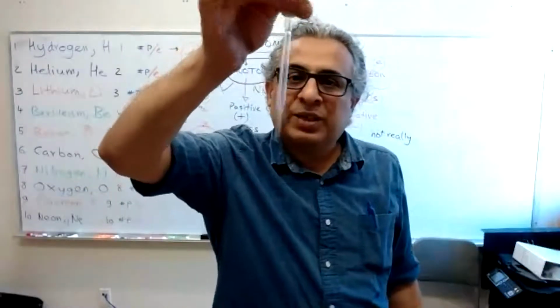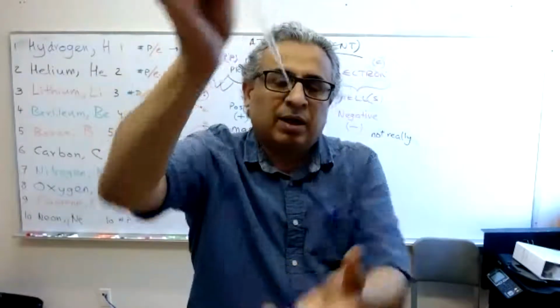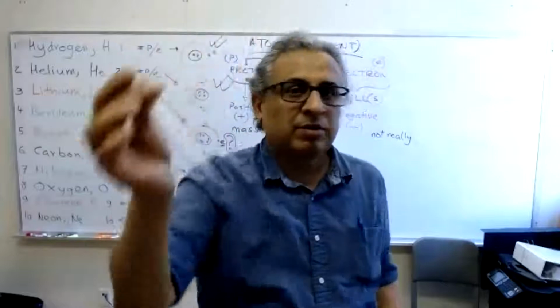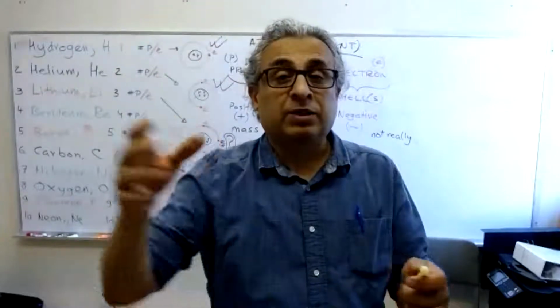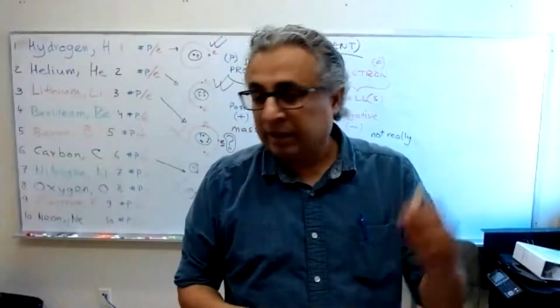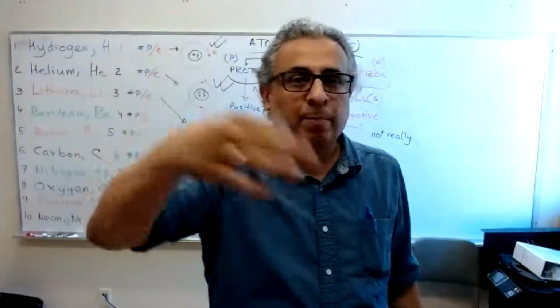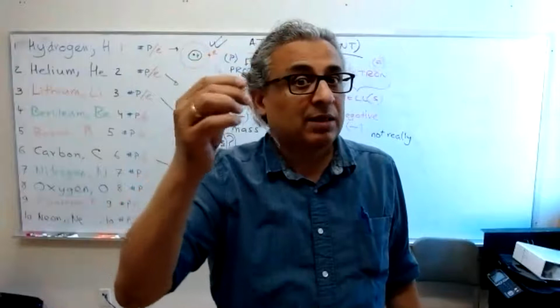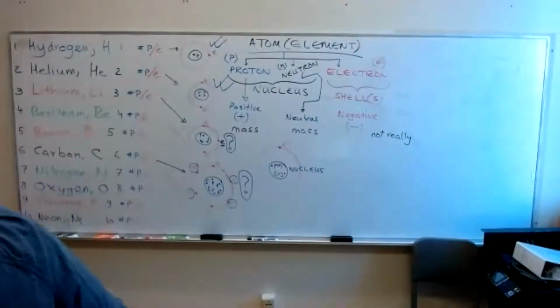Okay, now this is your medicine dropper. By squeezing it and inserting it in some liquid, you can suck it up, and then you can add it. This is just for transferring liquid from one place to another, in smaller amounts. When it gets to be too much, then you pour it or use a graduated cylinder or something like that. Once you're done with it, you throw it away in the broken glass waste container. Okay, that's that. What else?